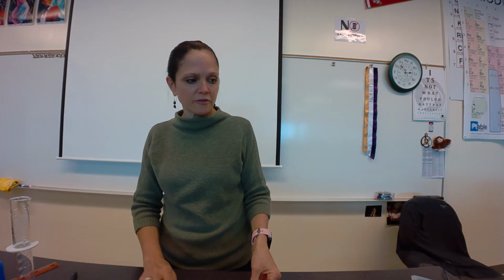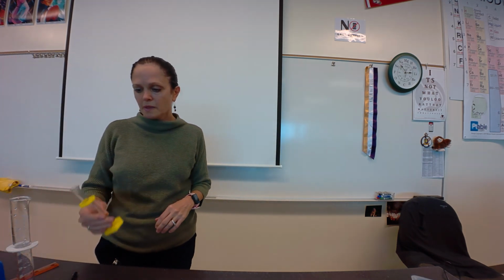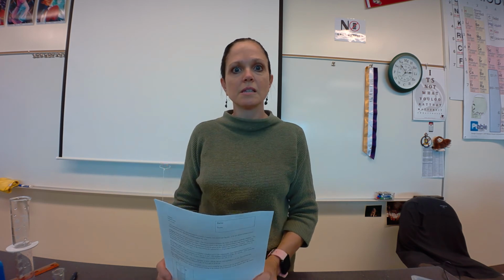All right, guys. So we are going to do our first density lab today. There are several pieces of equipment that we are going to need to use today. So let's talk about them one by one. I have uploaded this as a PDF document if you want to follow along, for those of you who are at home. The first piece of equipment that we are going to use is our balance.